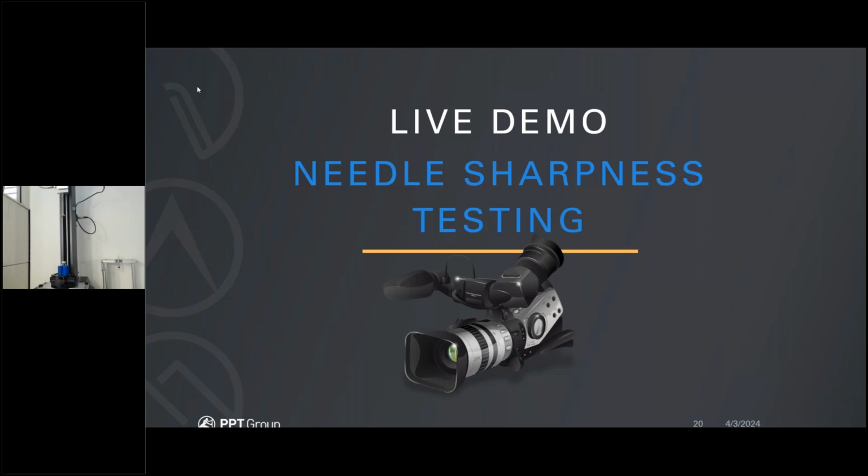One more thing we will do is lift this up a little bit and remove the 100 Newton load cell. And then we'll slide on our 25 Newton load cell, which is a lower capacity load cell that was designed to be a little bit more sensitive. And we'll just lower that. On this load cell, there is a plunger with a luer attachment that allows us to just screw in a needle just as we would a syringe. That way you use one universal fixture for all of the different needles that you will be testing.